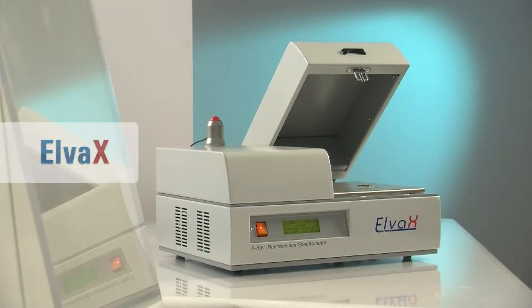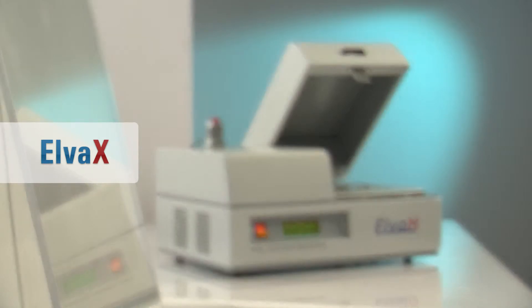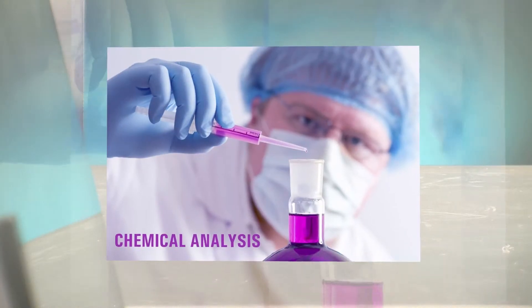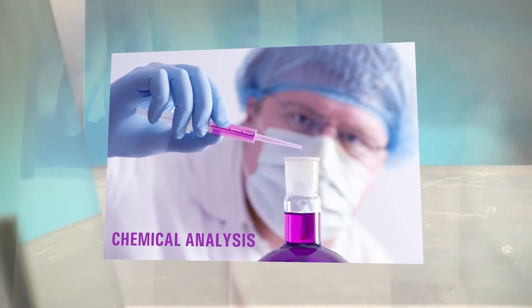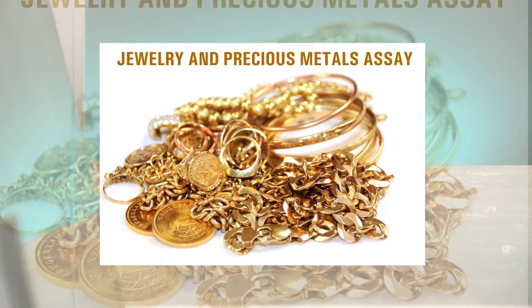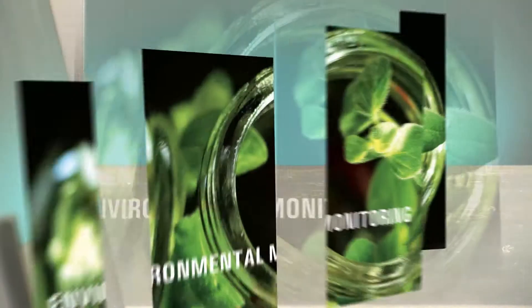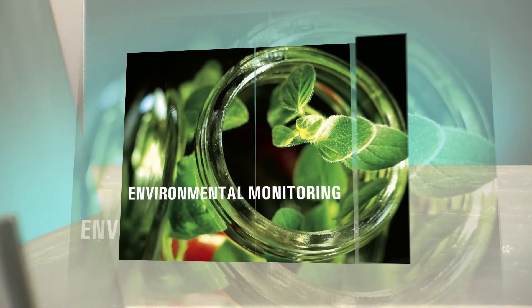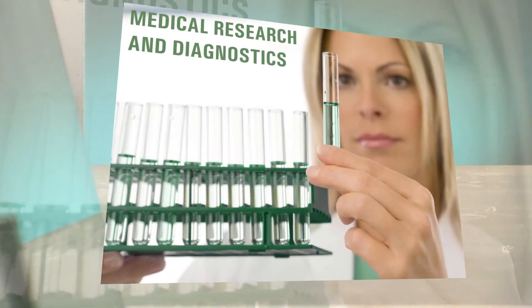ElvaX is a compact benchtop spectrometer designed to operate in a broad range of applications, such as metallurgy and chemical analysis, jewelry and precious metals assay, environmental monitoring, medical research and diagnostics, petrochemical and many more.